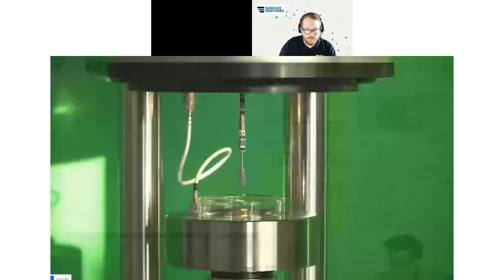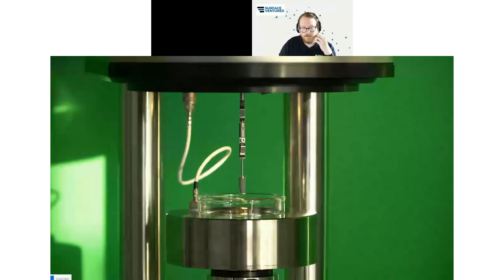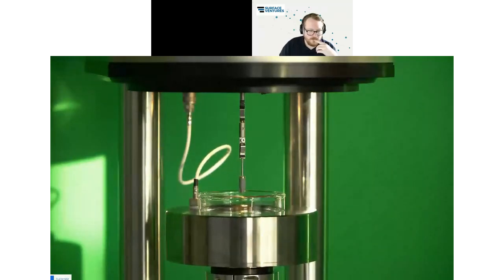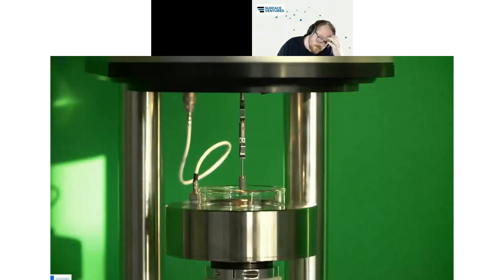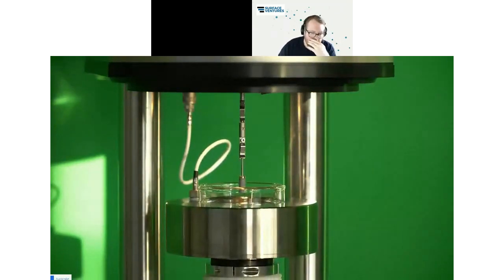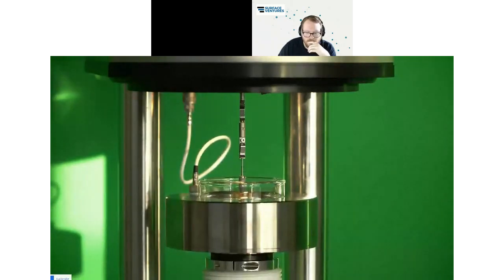Again, I want to first show you how the measurement is done. You see the implant is fairly high over the water level. Now the sample stage is moving upwards, and the clamping was just opened. The implant will be immersed 8 millimeters into the water and then pulled out again.